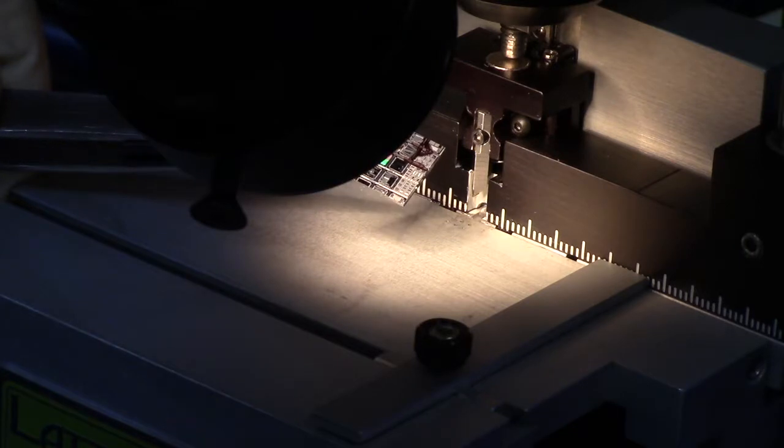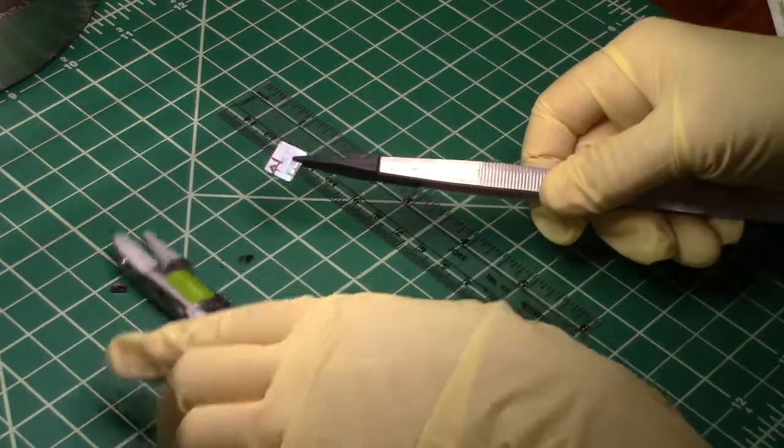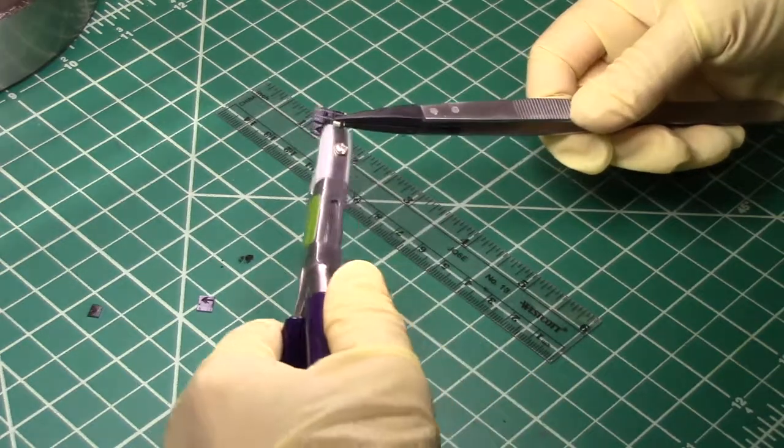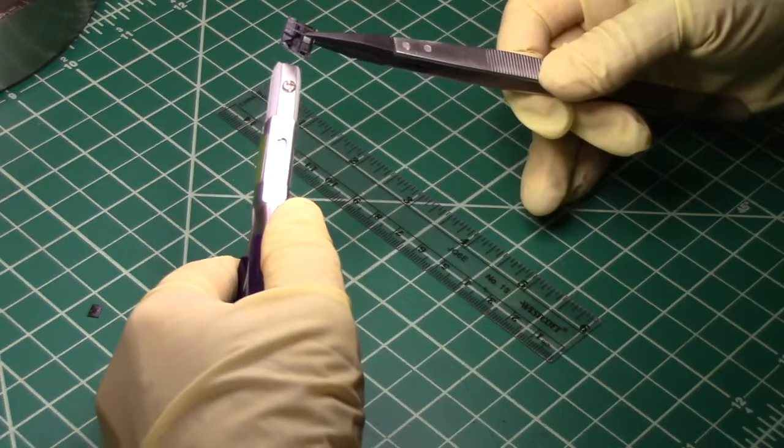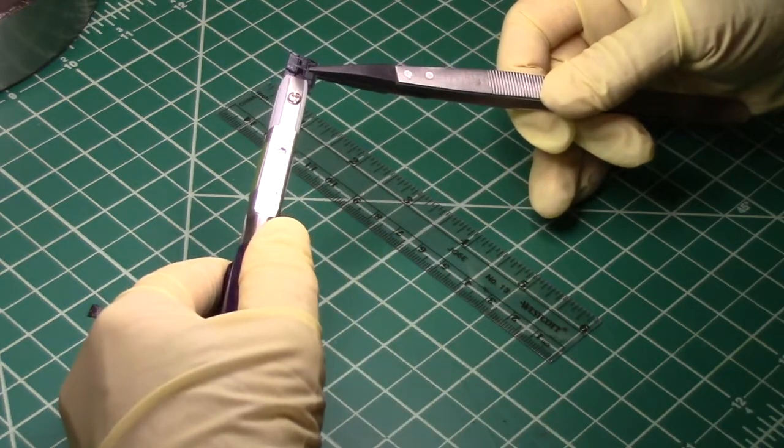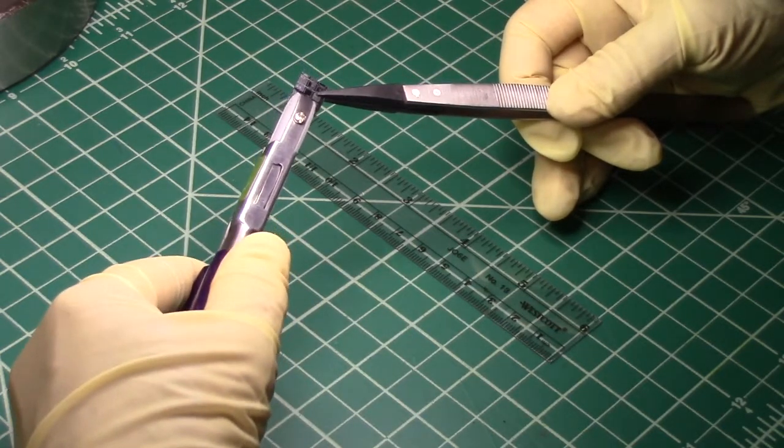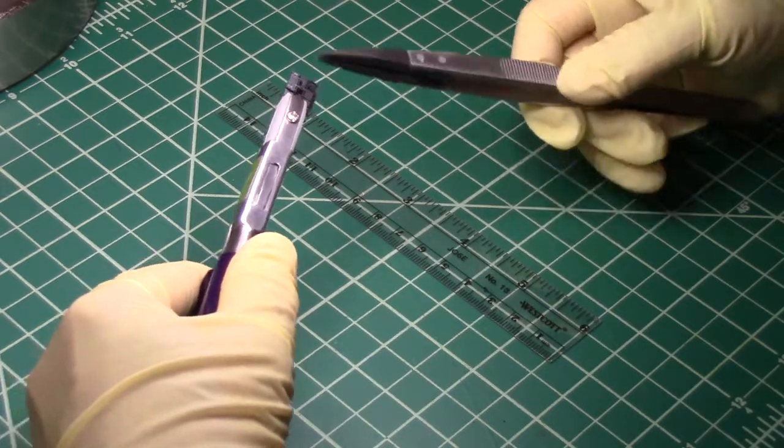And there you see the sample. In the next step, I'll use the small sample cleaving pliers to cleave the sample. I know where I have made my indent, so I'll just grab that edge with the indent.